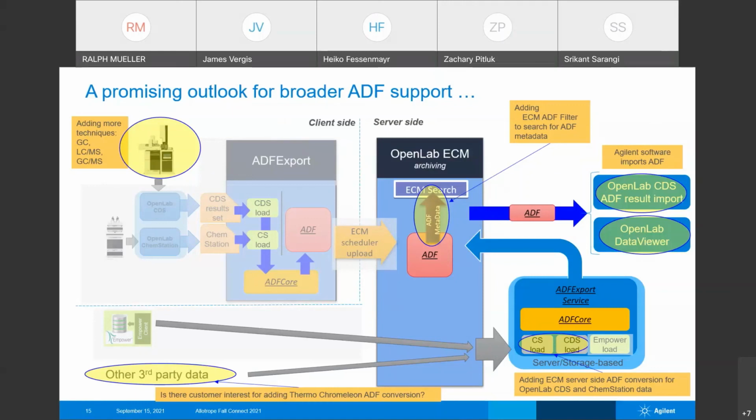What I also showed in my vision slide in the beginning is that we of course can send out ADF information for reuse. One thing of course is having smart data lake applications, but I think this is more up in the future.